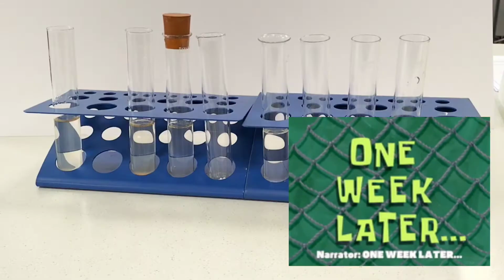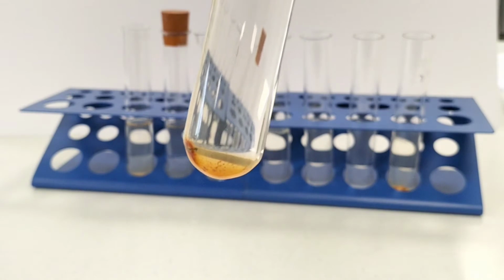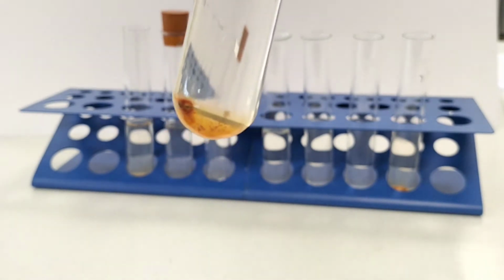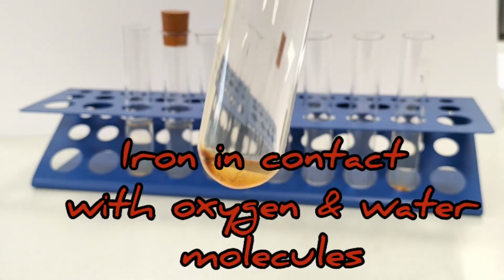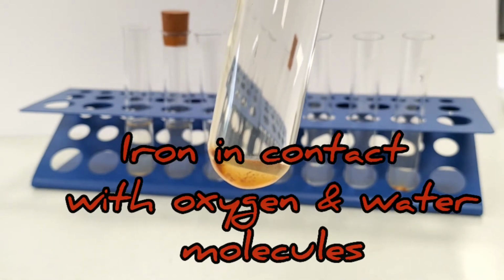One week later. So we're back after one week. We're going to look at the extent of rusting in each of those rusting experiments. Experiment 1 was our control experiment. We had an iron nail with access to both water and oxygen, and you can definitely see some rusting has occurred there. And that's really important for our understanding. For rusting to occur, iron must be in direct contact with both water and oxygen.